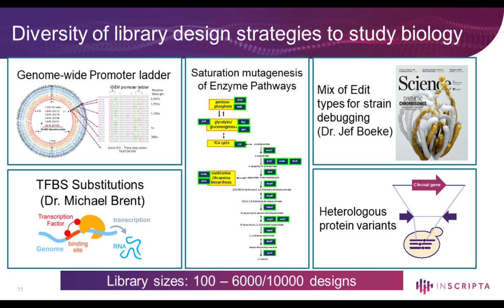The library sizes can range anywhere from 100 designs to, say, 6,000 designs in yeast and 10,000 designs in E.